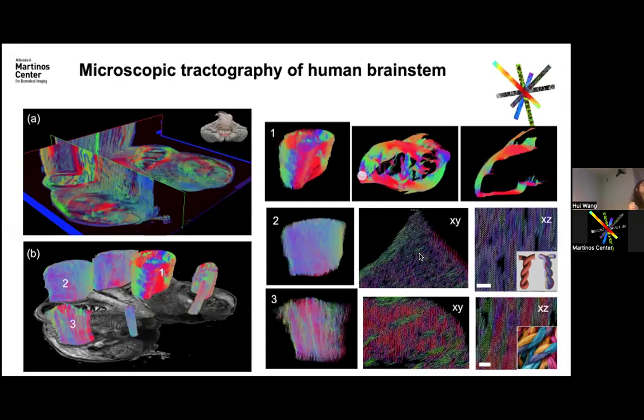For example, the pyramid is a very compact fiber bundle, and they form small groups that travel, navigating not directly but through this bundle. So I think it's known in general. But I can't show this with the current tractography tool, so this is my interpretation.